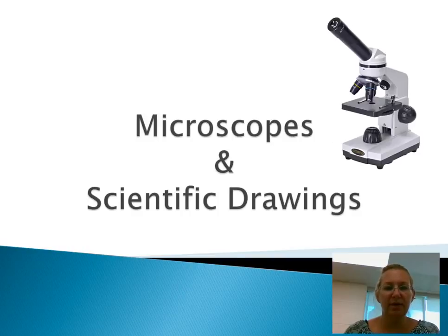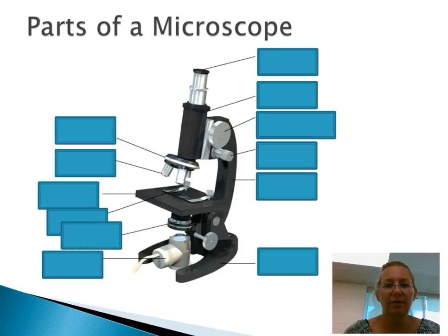Okay, so this is a quick video to review the parts of the microscope, how to use it, and how to do scientific drawings. So let's quickly go over the parts of the microscope. We're going to start with the piece that we look through.